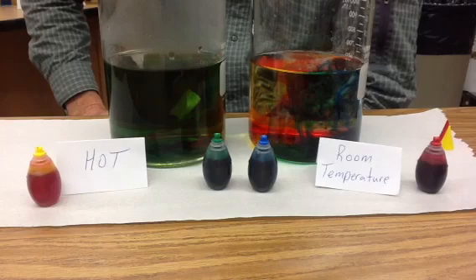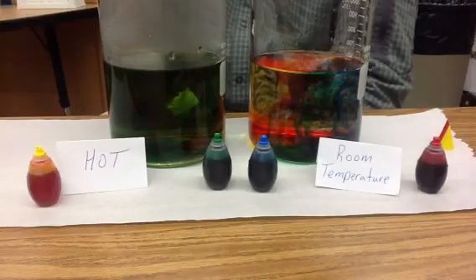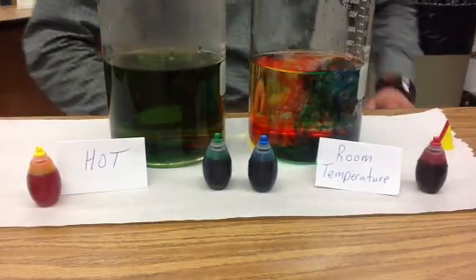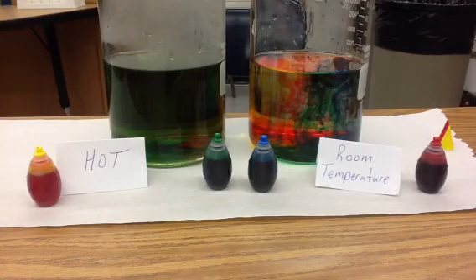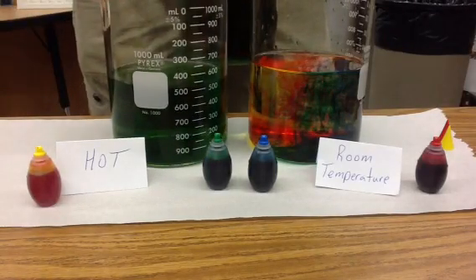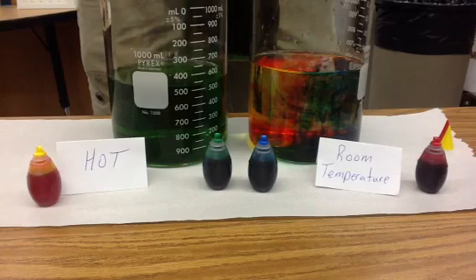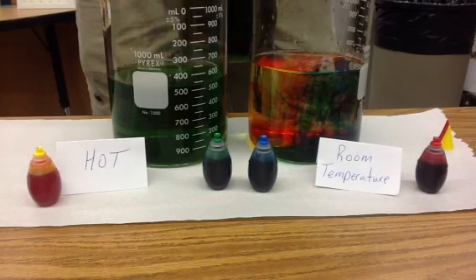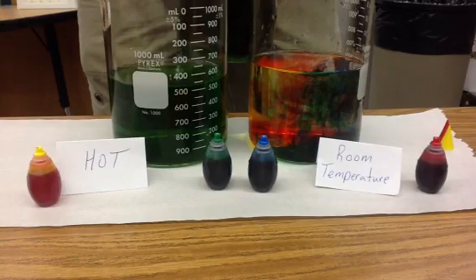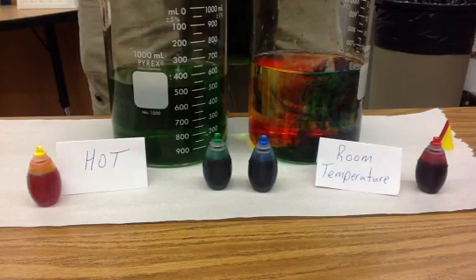A quick demonstration of diffusion by creating concentration gradients. This one hasn't reached equilibrium yet but is getting there very quickly; this one is not. Here's an example from last week — as you can see, this one has reached equilibrium. There is no longer a concentration gradient of any of the dye molecules; they are all equally distributed in the beaker. Therefore, diffusion is no longer occurring. The molecules are still moving and colliding, but there is no net movement from an area of high concentration to an area of low concentration.